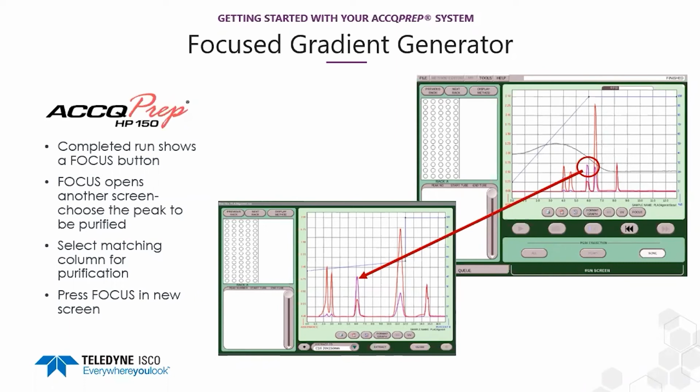You just inject a small amount of sample for the scouting run. Using the columns installed on the ACCQPrep for both scouting and purification runs ensures matching column chemistry. In this example, the peak at 5.8 minutes was chosen. This is the third eluting peak, and the calculated gradient is also shown on the screen.